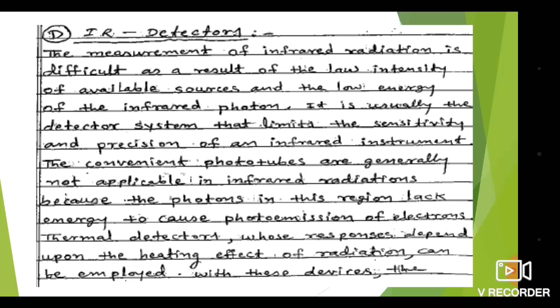The measurement of infrared radiation is difficult as a result of the low intensity of the available sources and the low energy of the infrared photon.